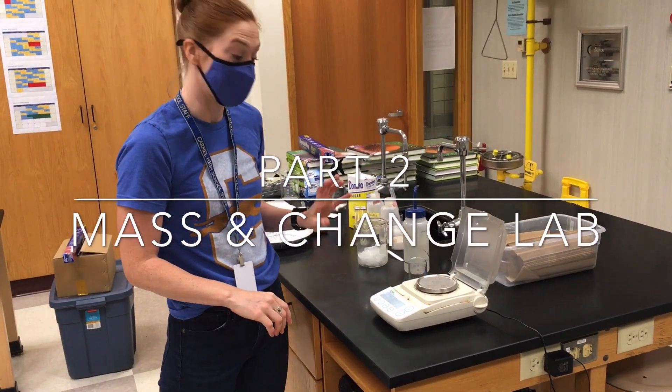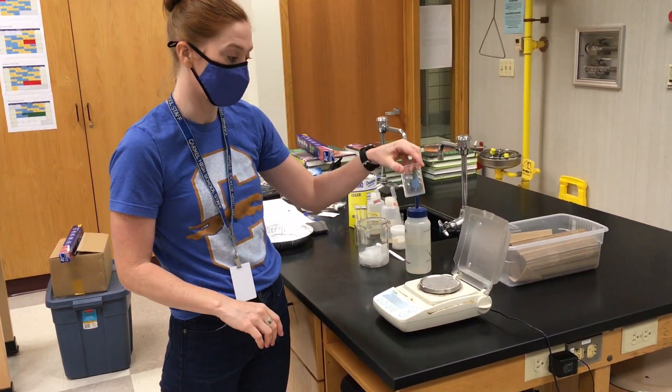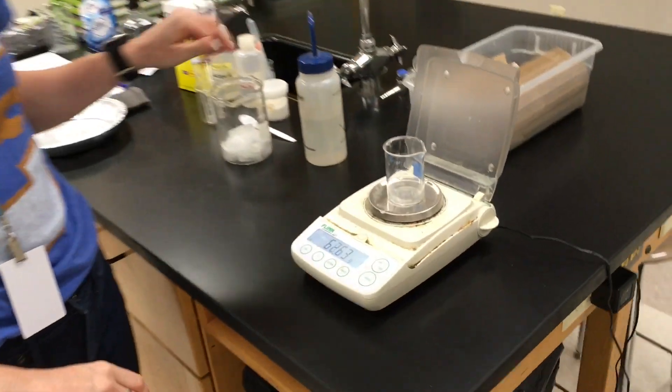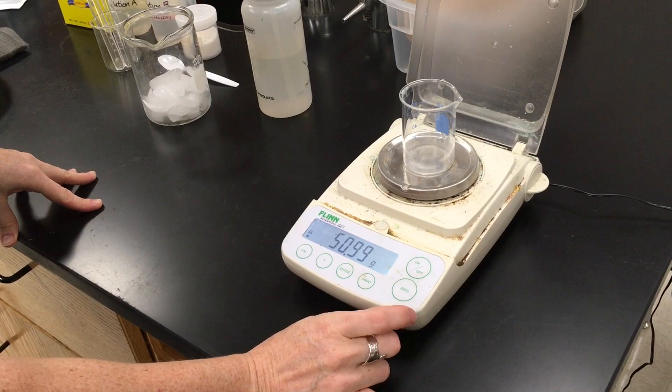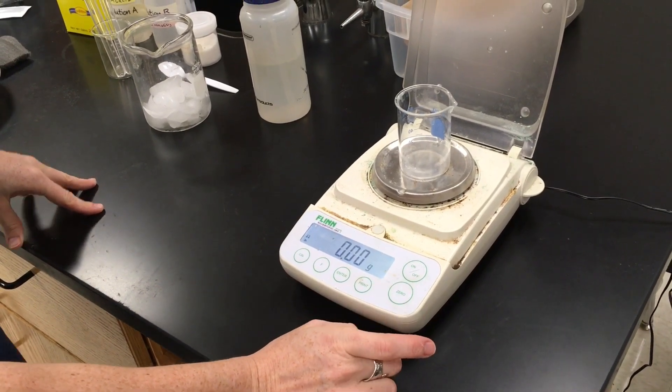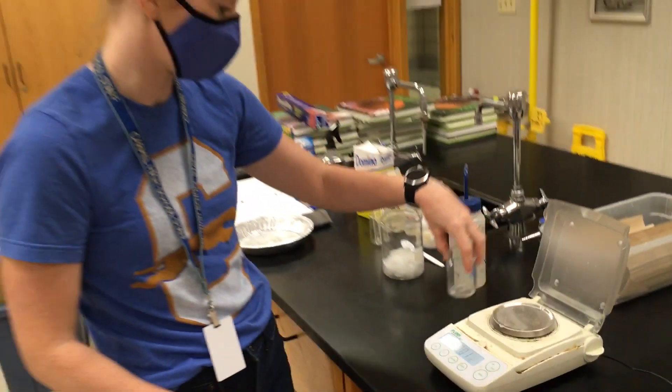All right, this is part two with the mass of ice and water. I'm going to take a small beaker, put it on the balance, and I want to take away the mass of that beaker. So I'm going to hit zero on the balance — some balances say tare, T-A-R-E. So now it's down to zero.